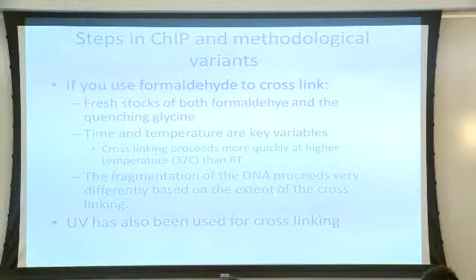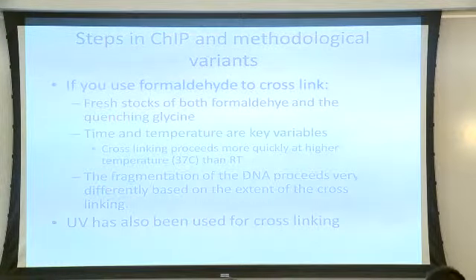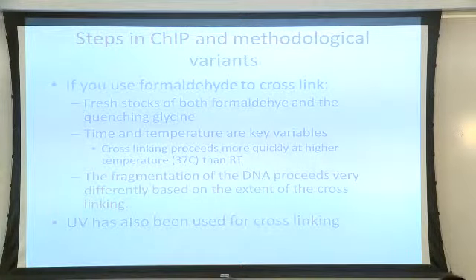But the fragmentation of the DNA proceeds very differently based on the extent of the cross-linking, and so we know there's a tremendous difference between DNA that is under cross-linked and over cross-linked in how it sonicates. UV has also been used for cross-linking. It was used in that original paper that I mentioned.